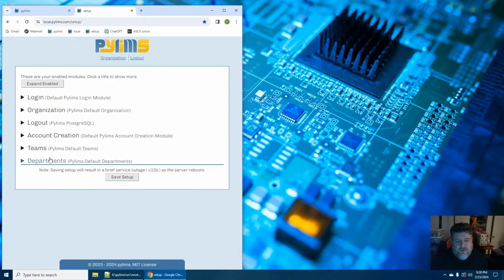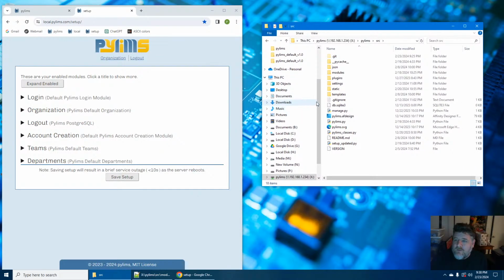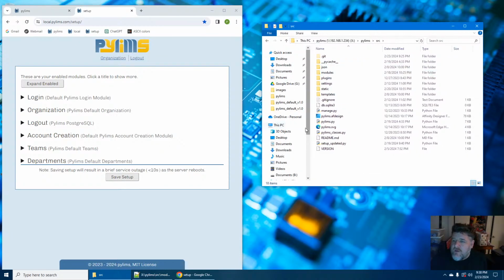So, actually, you know what, let me go a little bit deeper first. One second. So let's go here. Can I shrink this or something? It doesn't matter, I guess. Alright.